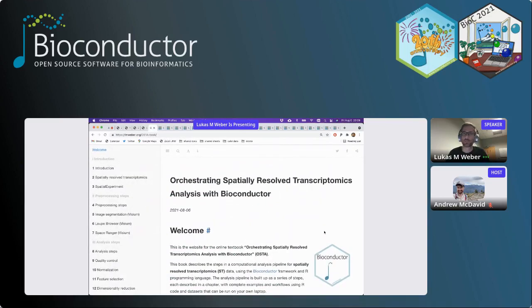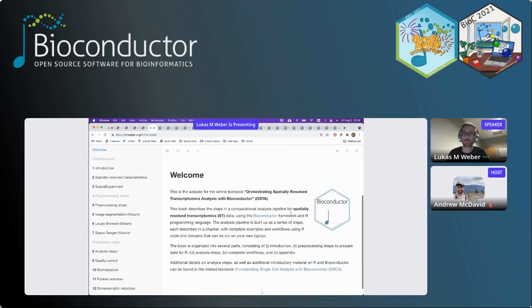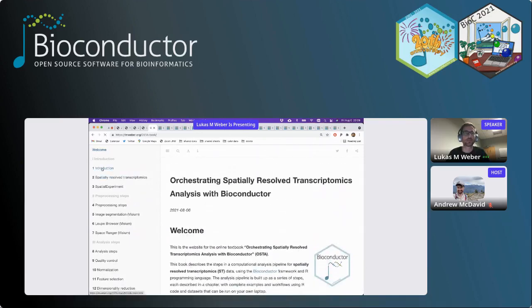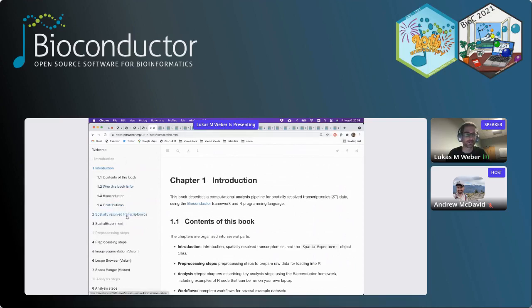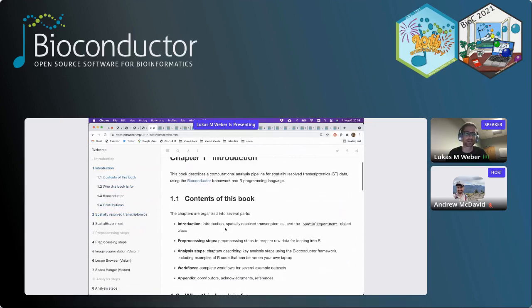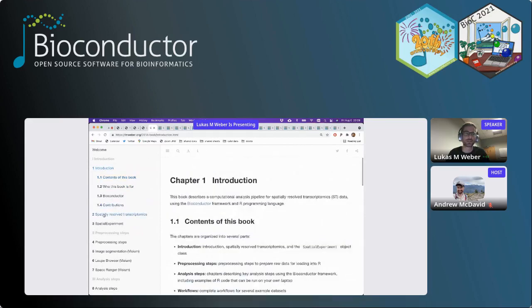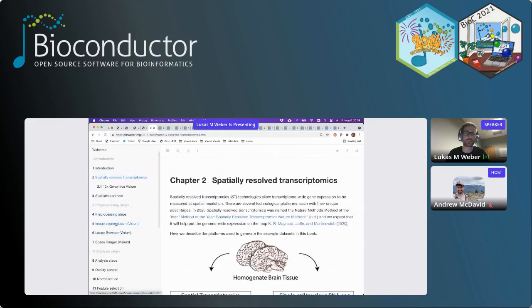This is a 10x Genomics Visium data set from human brain in the dorsolateral prefrontal cortex region from our publication. The full data set contains 12 samples. For these examples, we've taken one of those samples and formatted that into a spatial experiment object. The full data set is also available from a spatialLIBD Bioconductor package that Leonardo Collado-Torres has put together, and there's a Shiny web app to explore that further.